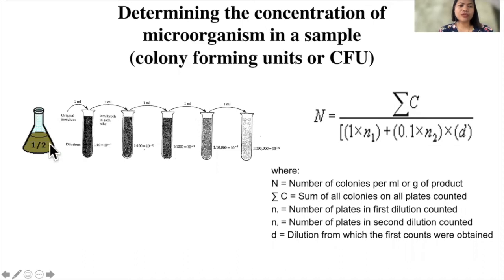So for example, this is your fermented product. We know that in fermented product, there's a lot of organisms present in there. Now we have the three groups, the fungi, the bacteria, and possibly virus. But hopefully walang virus. Okay, so in this lecture, I will be teaching you how to determine the CFU, bacterial CFU. Okay, so if you know initially that our sample has high number of bacteria in particular, you will be doing a serial dilution. So how do you do that?